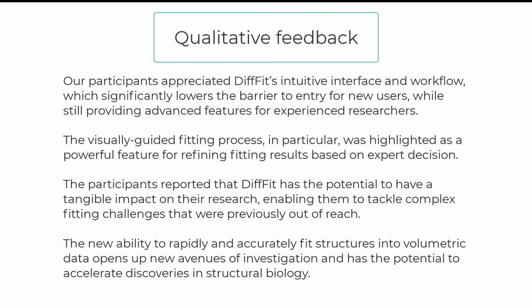The participants reported that DiffFit has the potential to have a tangible impact on their research, enabling them to tackle complex fitting challenges that were previously out of reach. The new ability to rapidly and accurately fit structures into volumetric data opens up new avenues of investigation and has the potential to accelerate discoveries in structural biology.